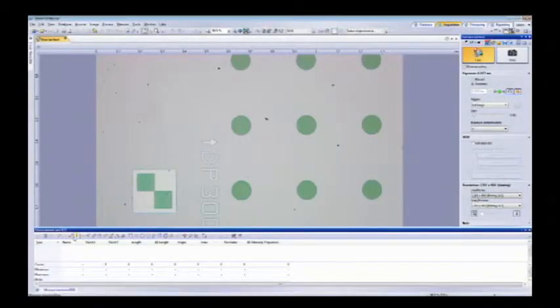Real quickly, some of the quick stuff that you use is manual measurement functions, and down here on this bar we have a lot of different manual measurements that have been in the software forever. Line width measurements, angle measurements, area measurements can all be done manually on a picture that's taken. We've added a couple new features to this. We got feedback from customers. A lot of customers wanted to be able to do circle-to-circle length measurements, so we have that new feature in the manual measurement toolbar.